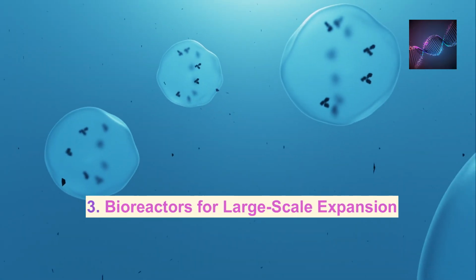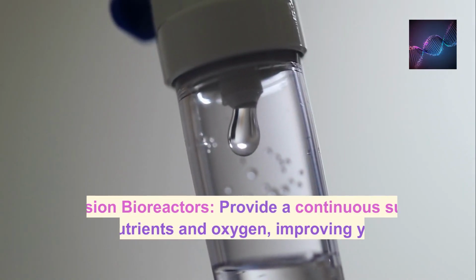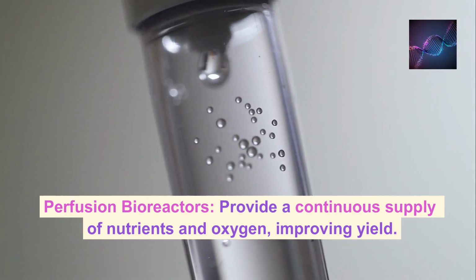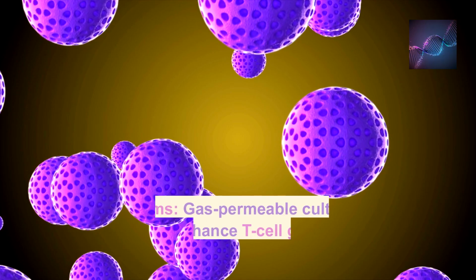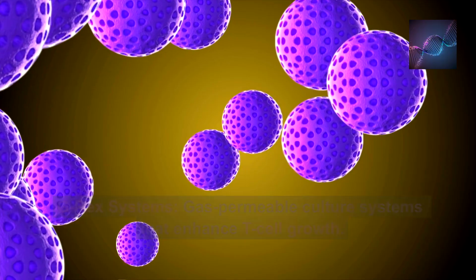3. Bioreactors for large-scale expansion, perfusion. Bioreactors provide a continuous supply of nutrients and oxygen, improving yield. G-Rex systems, gas-permeable culture systems that enhance T-cell growth.